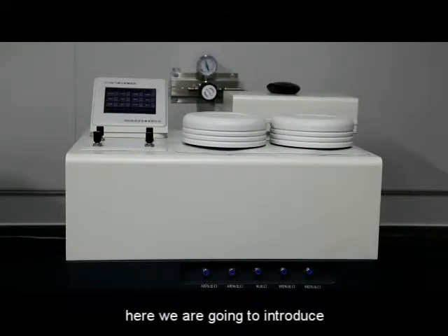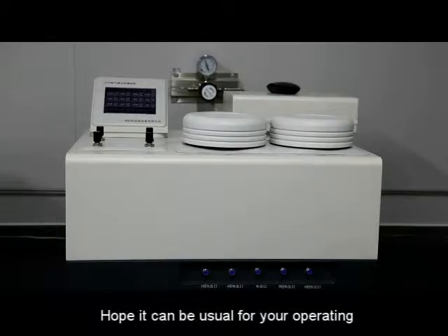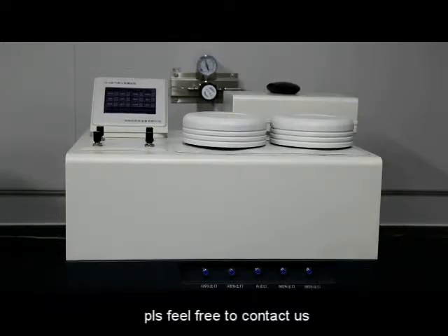Dear customer, here we are going to introduce our Y210 Oxygen Transmission Rate Tester. Hope it can be useful for your operating. Any problems in the using of the instrument, please feel free to contact us.